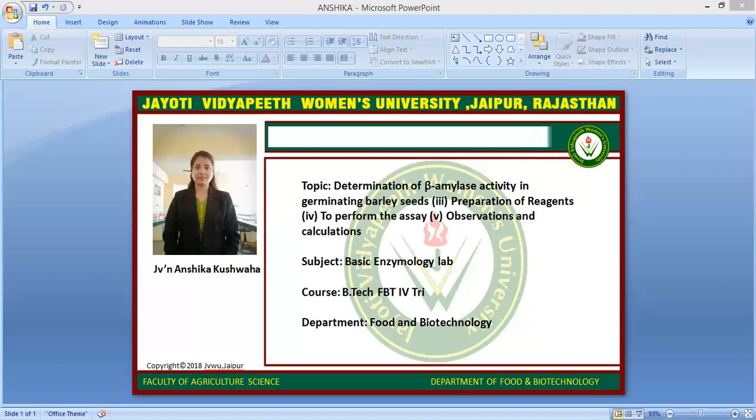This mixture is called the amylase reaction mixture. Immediately starting with well 0 on the ceramic plates, one drop of the amylase reaction mixture is added to the iodine using a pipette. At one-minute intervals, another drop of the amylase reaction mixture is added to another well. This is repeated until the achromic point is reached. When the achromic point is reached, the time elapsed is recorded.